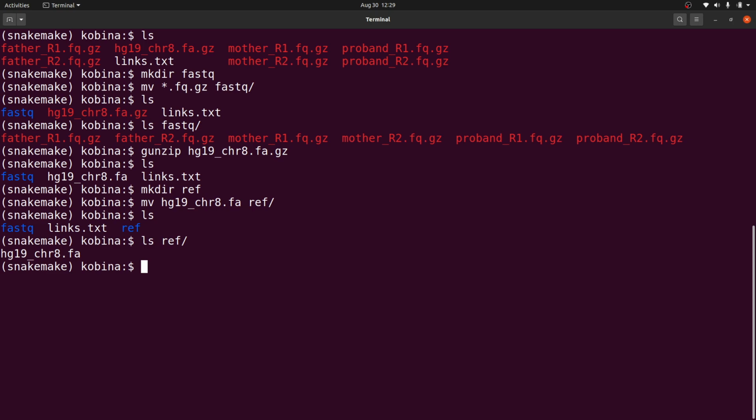So I'm going to first perform the mapping using BWA, and then after that we will write the script for the Snakemake pipeline. All right, but if you want to include that in the pipeline, you can always reach out to me. You can have a session and I'll show you how to do all those things. But this tutorial is for beginners, and so I prefer to tackle it one point at a time. So I'll just do the indexing outside and then we'll proceed with the main activity, which is mapping.